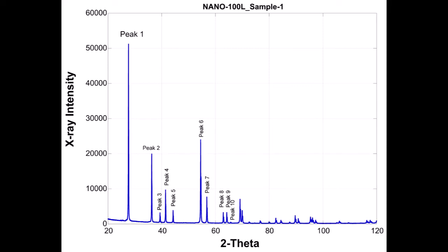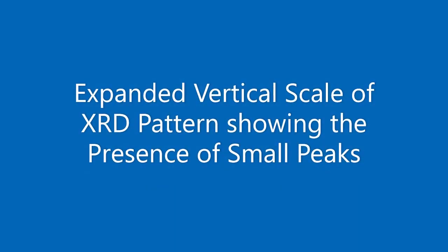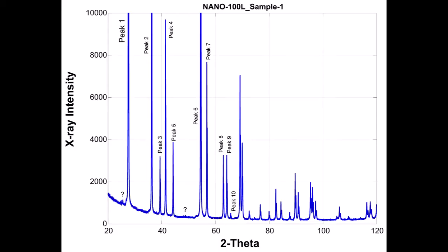Your task is to identify the d-spacings for at least the first 10 peaks in each pattern. Then use those d-spacings along with the database of oxides and their corresponding d-spacings that we've provided and determine which material, in terms of which metal oxide, is associated with each of the 7 unknown samples.